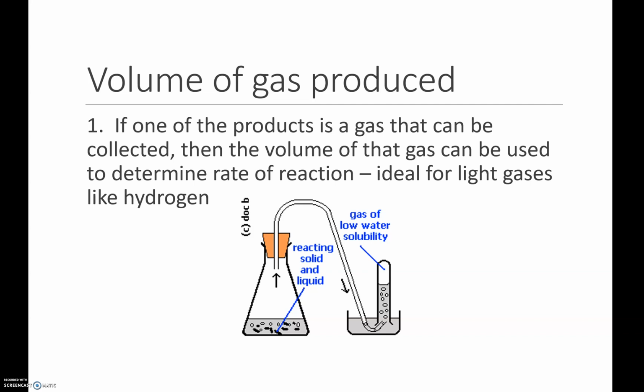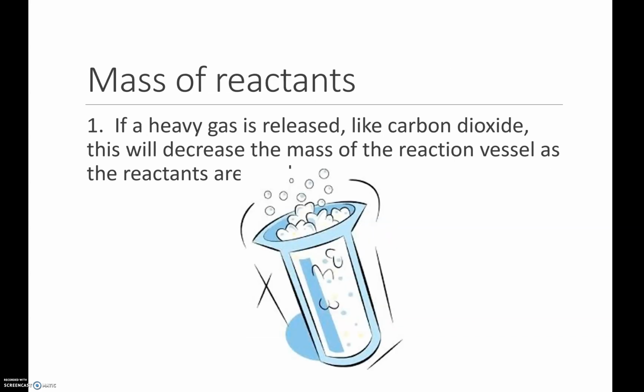And so with each 30 seconds or so, we can measure down the new time, and that time will allow us to determine the data for the graph, which will then allow us to determine the rate at a specific time.